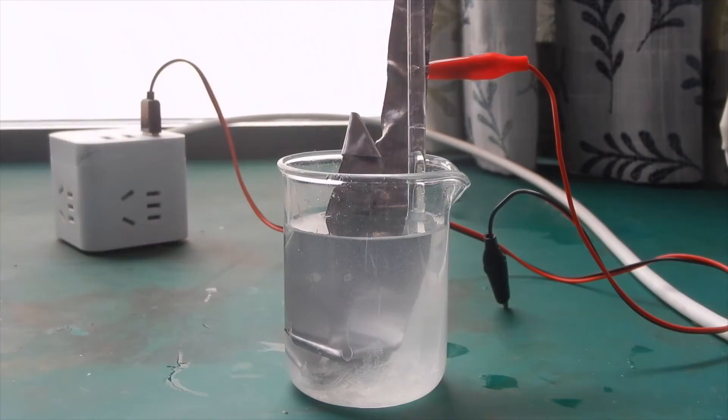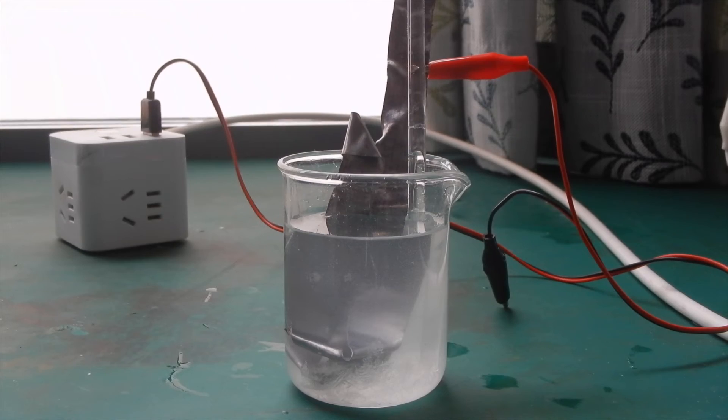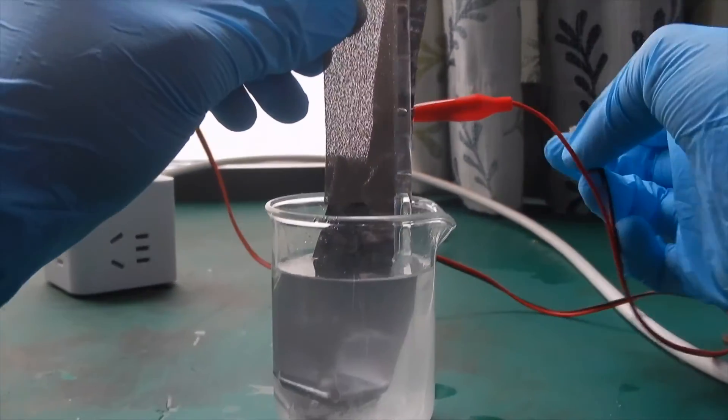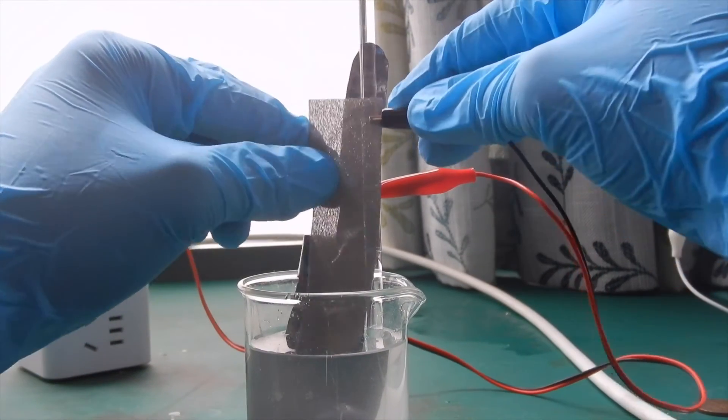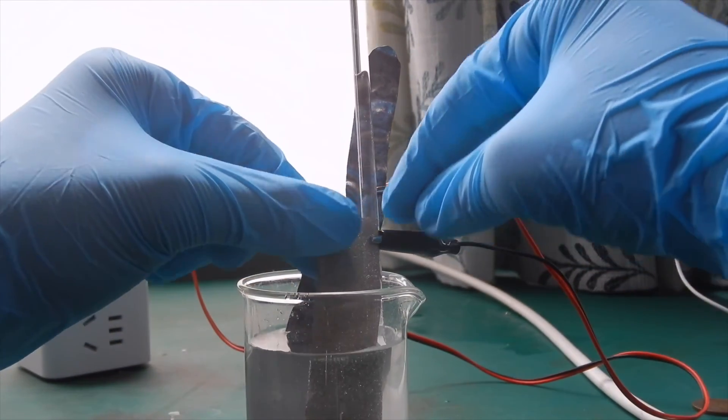We put the lead into the solution and connect it to the anode. We then place in a piece of foam nickel, which is basically nickel plated on sponge, as the cathode. Electrolysis is then performed for several hours.